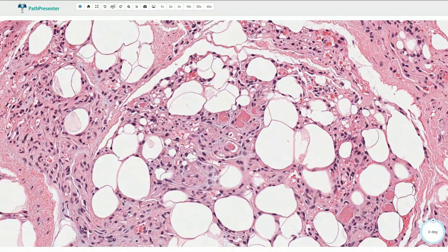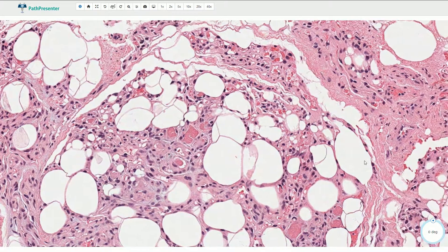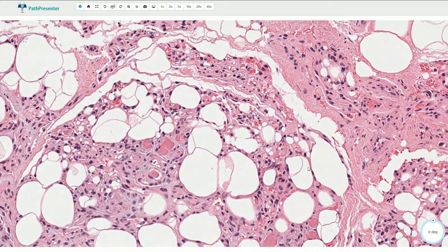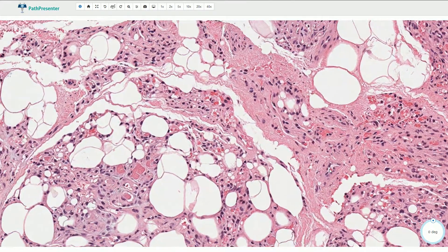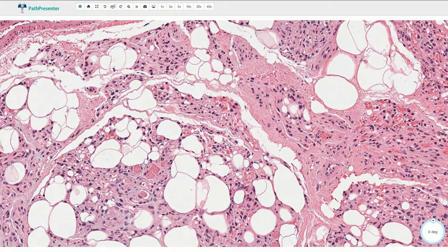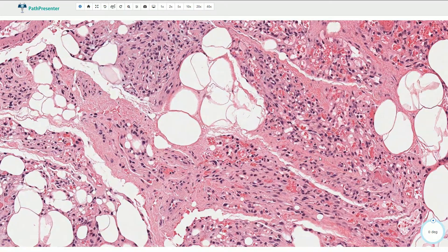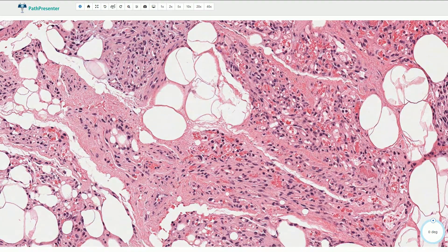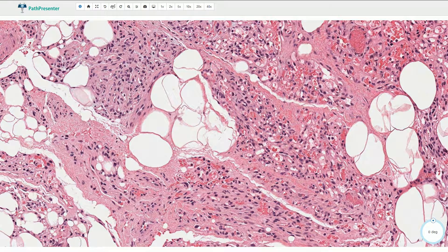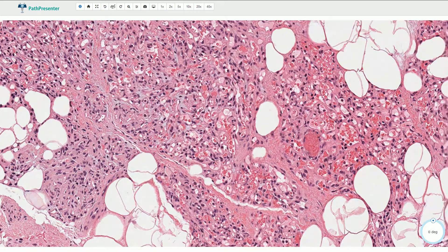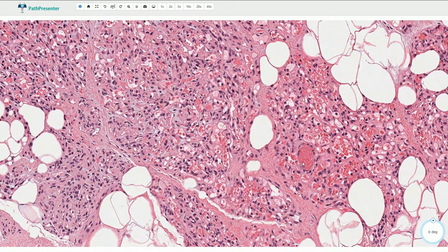If we want to be sure that this is fibrin and not just degenerated erythrocytes, we can use a fibrin special stain. With this stain we can find erythrocytes in most of these small blood vessels and a fibrin thrombus here.